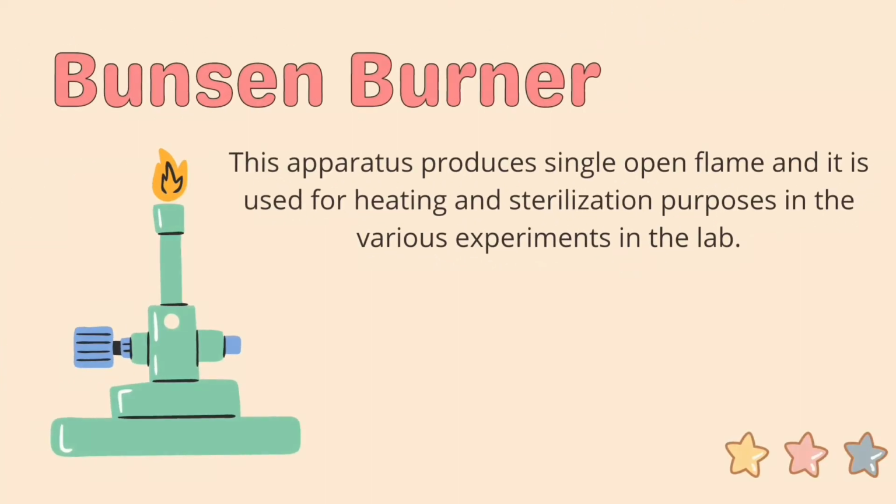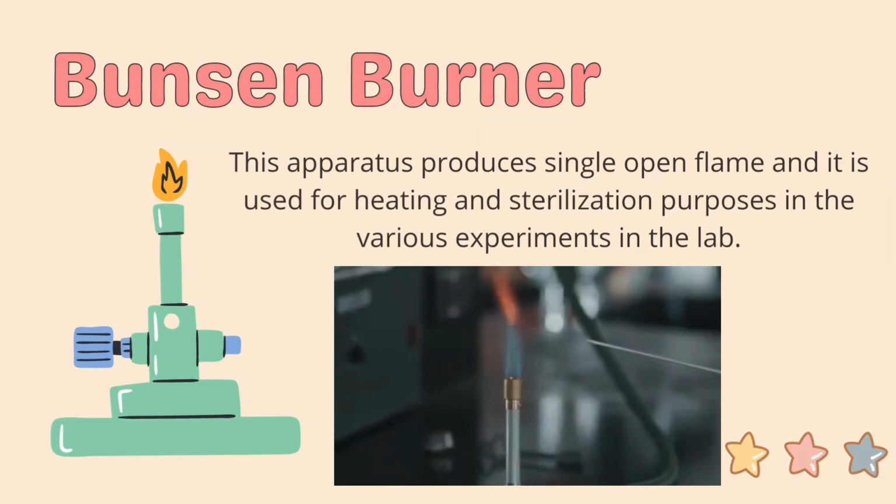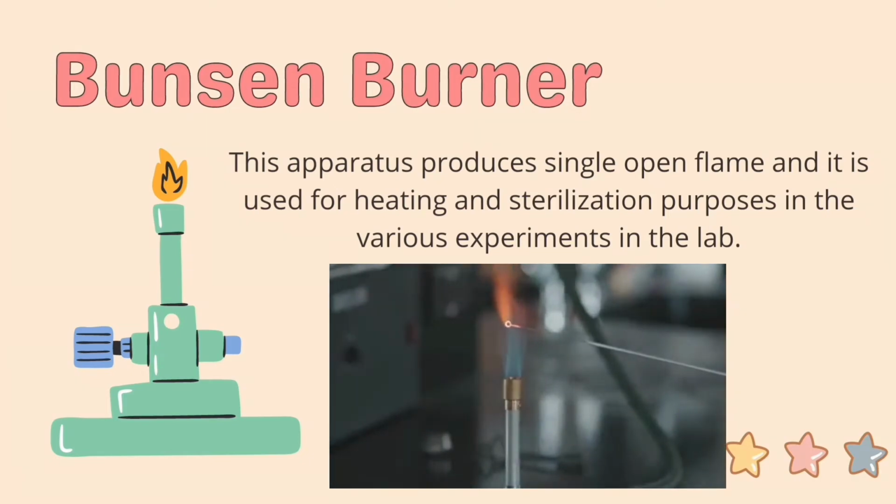Bunsen Burner. This apparatus produces a single open flame and it is used for heating and sterilization purposes in the various experiments conducted in the laboratory.